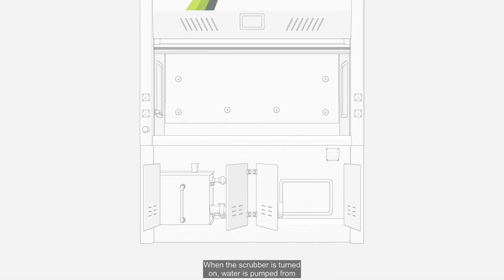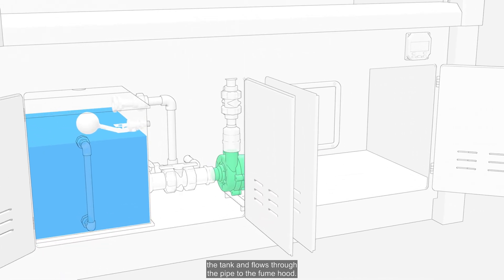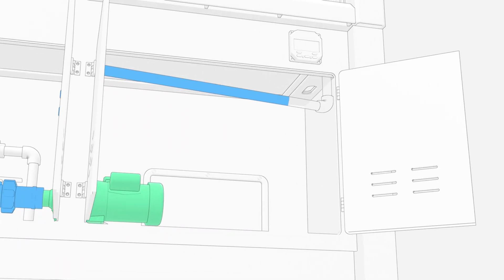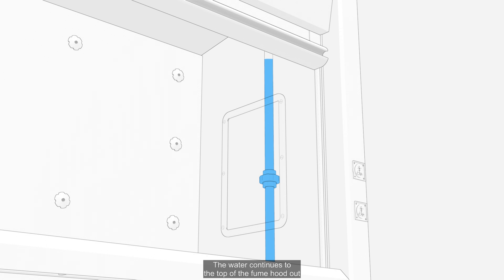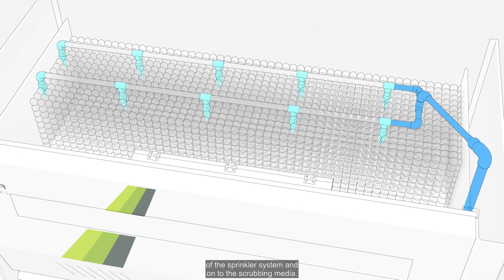When the scrubber is turned on, water is pumped from the tank and flows through the pipe to the fume hood. The water continues to the top of the fume hood, out of the sprinkler system, and onto the scrubbing media.